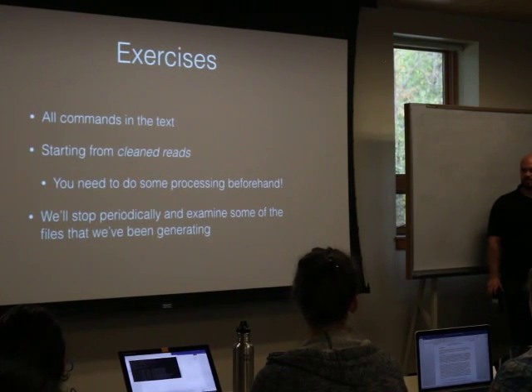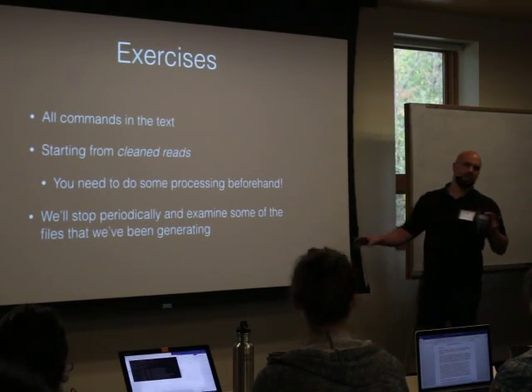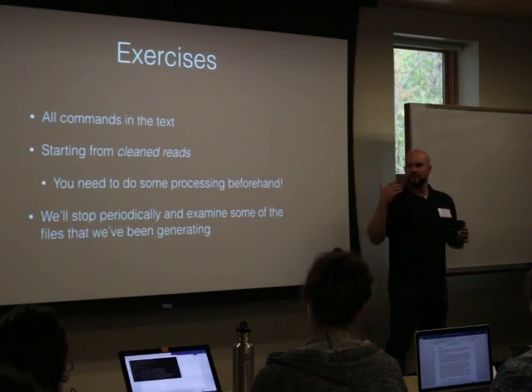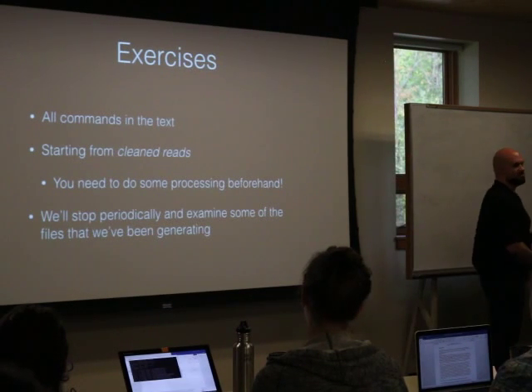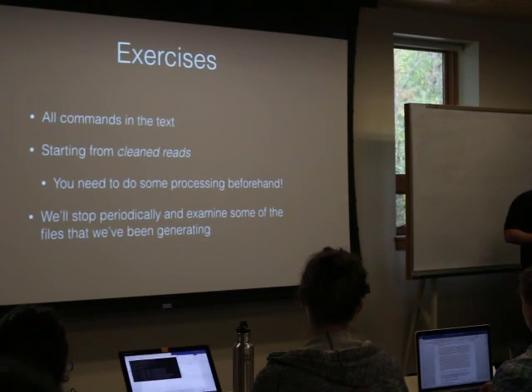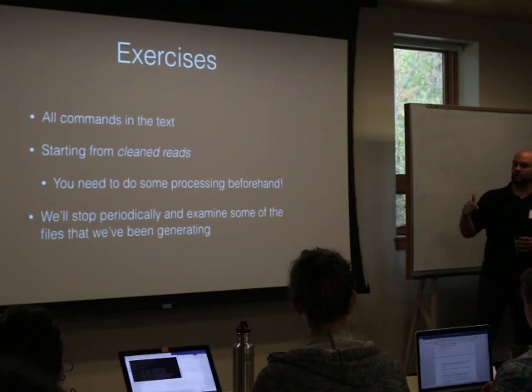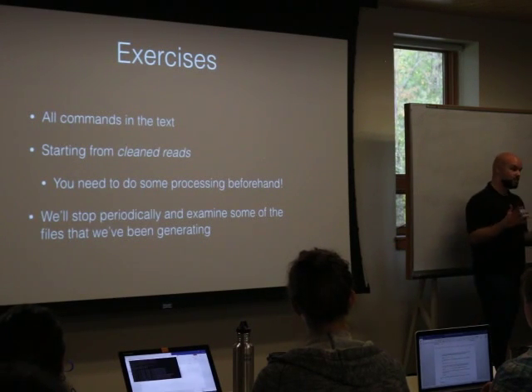As part of the workshop, I have you looking at the data structures, but as you might expect, there are lots of things in here, tons of information per line. You might have 75 million reads, and there's going to be 75 million lines in a BAM file, with lots of additional information, these huge files. So visualizing them can be a little bit tricky, but understanding what's actually going on in those files is important in figuring out what's going on with your analysis.